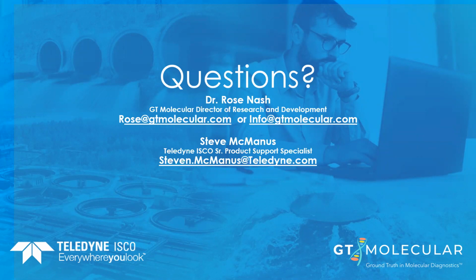Kaushal, do you have anything that you would like to add to that question? Sure. So if I have to answer this question based on type of locations you have, then basically if you have a permanent location such as a treatment plant influent, then you might have an existing flow meter, and the ISCO sampler has a flow meter port. So you can connect those flow meters with an ISCO sampler and you can take the flow pace sampling.